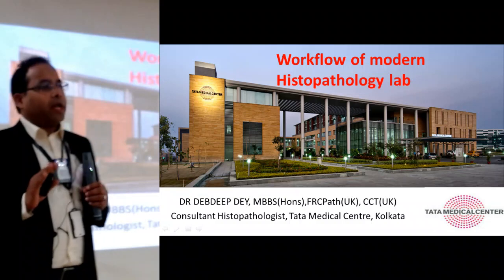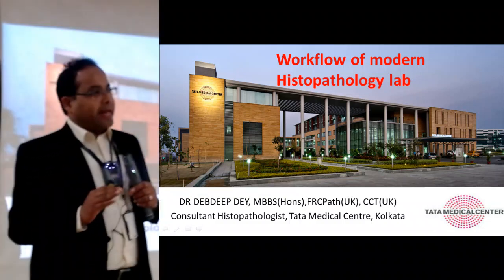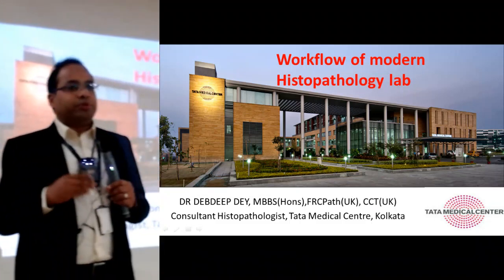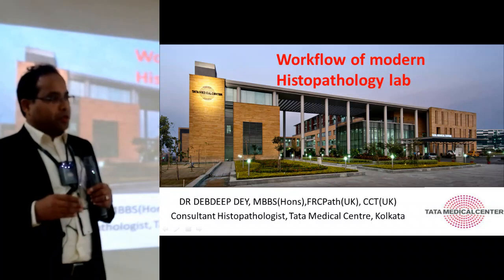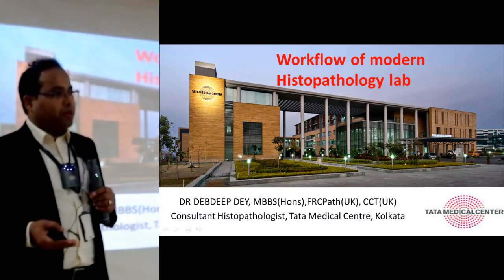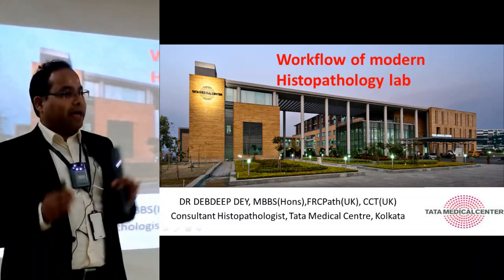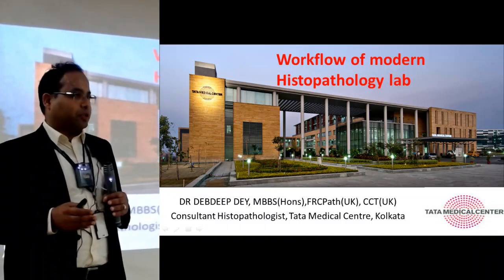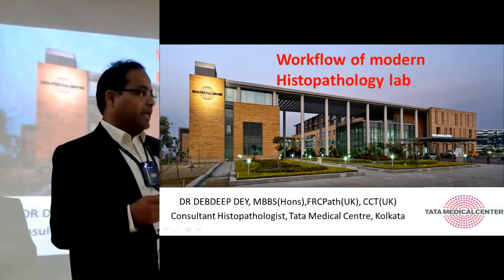So what I'll do, I'll give you a flavor of a modern histopathology lab, and at the end, touch upon computational pathology and digital pathology, although my colleague, Dr. Paramita, who's going to come in tomorrow, will be more elaborate on the computational pathology. I will just introduce computational pathology after giving a flavor about how the modern histopathology lab will work.